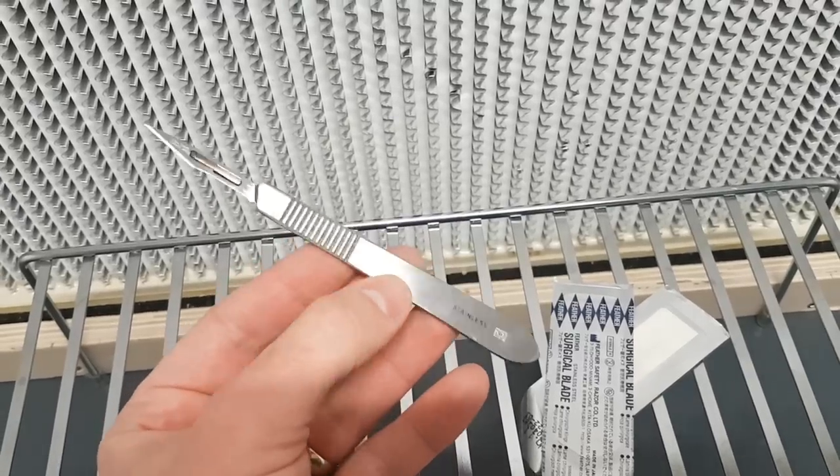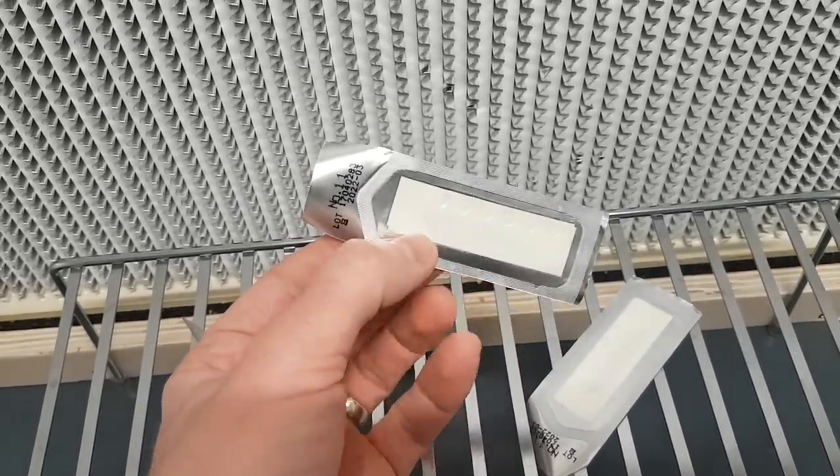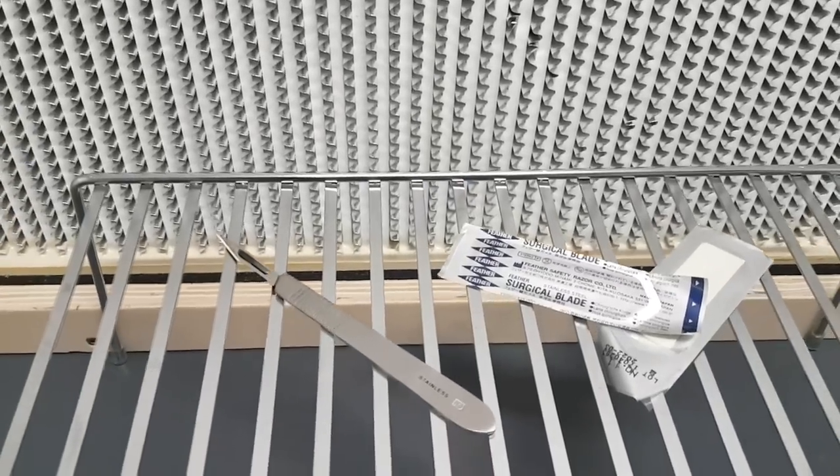For transferring cultures and inoculating grain spawns, consider getting a simple scalpel. These are really cheap and work excellent for cutting mushroom mycelium off an agar plate and dropping it into grain spawn or transferring to another plate. They're super sharp — no problem cutting through even reishi or stronger mycelium — and easy to sterilize before transfers. You buy the handle and get replacement blades; I like the number 11 blades. Of course, a simple knife or any sharp blade will work just as well.